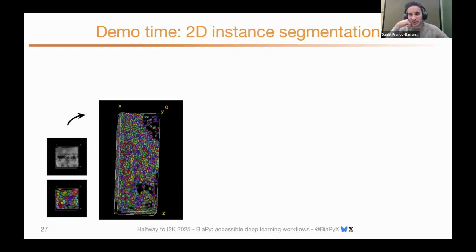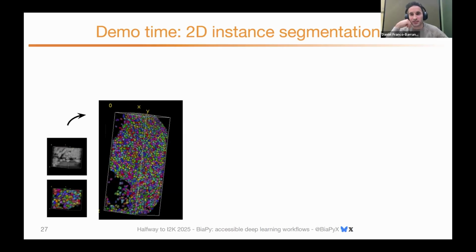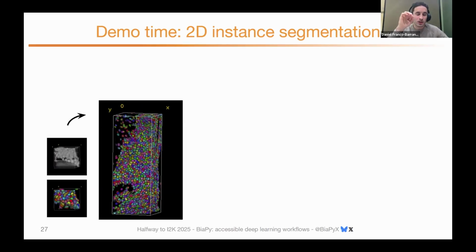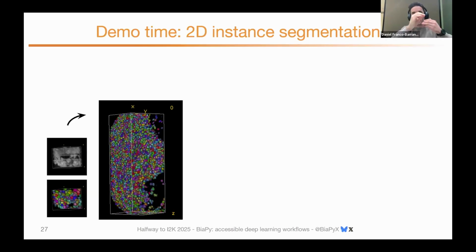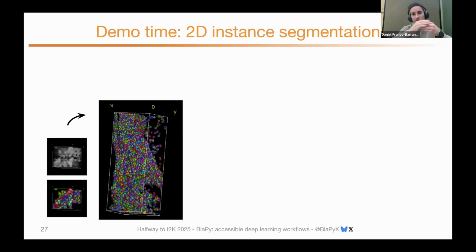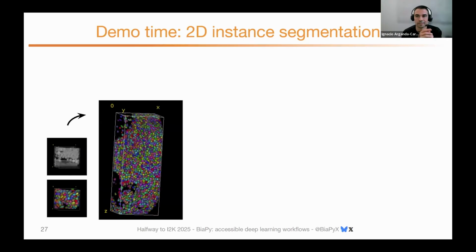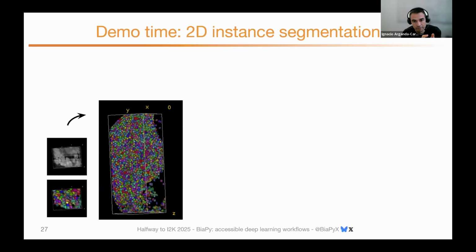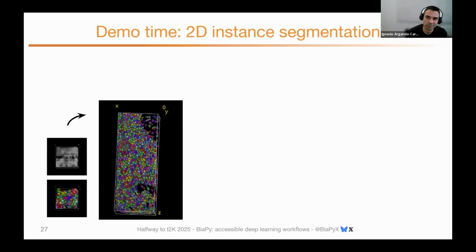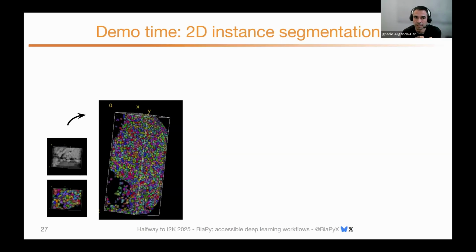Yeah, but you need to know the object shape. If you want to do 3D, you just reuse the same point in all the slices, but whenever you are out of that object, you are going to segment something that is not the object. So, if I may interrupt, in MicroSAM they also now have the option, based on a UNet, to do the automatic segmentation.